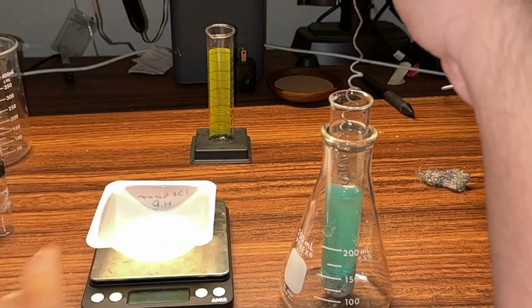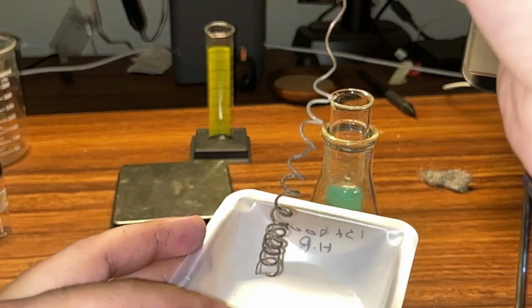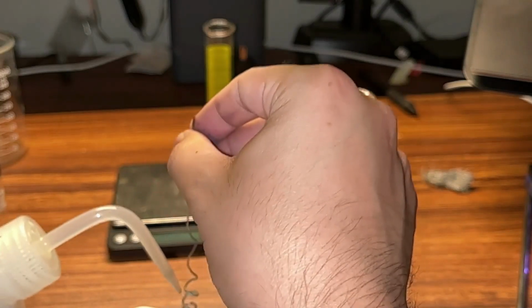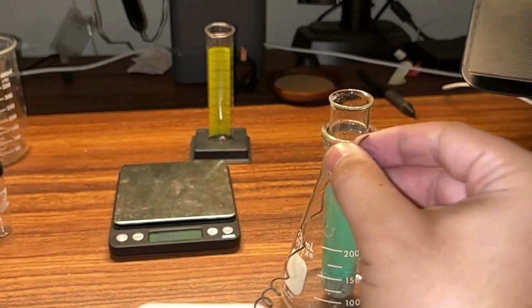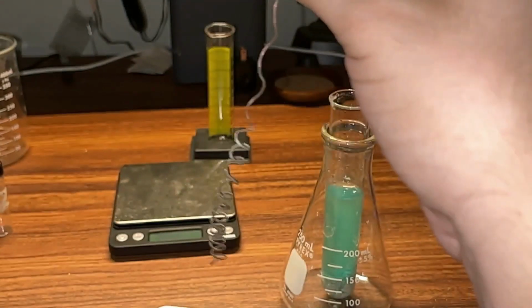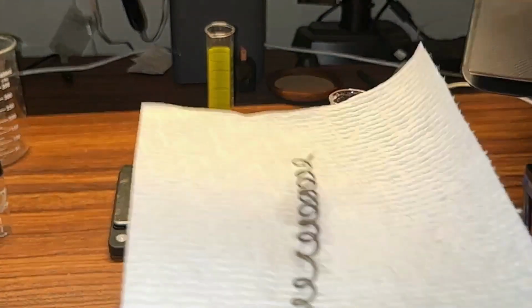And now, if you look at it closely, you'll see that there is still some silver. I can't get the camera to focus. There we go. You can see some silver still on there. So I'm just going to rinse that off. I'm going to rinse it right into my weigh boat, because this is where I want all my silver to be in the end. And you can't see what I'm doing right now, but that is okay. I'm just rinsing it. I don't think I got any silver in that weigh boat. That's okay. There's not really that much on here in the first place. Sometimes you get a whole bunch of silver just stuck to the copper for some reason, but not this time. That's fine. I'm going to set that on this paper towel so it can dry.